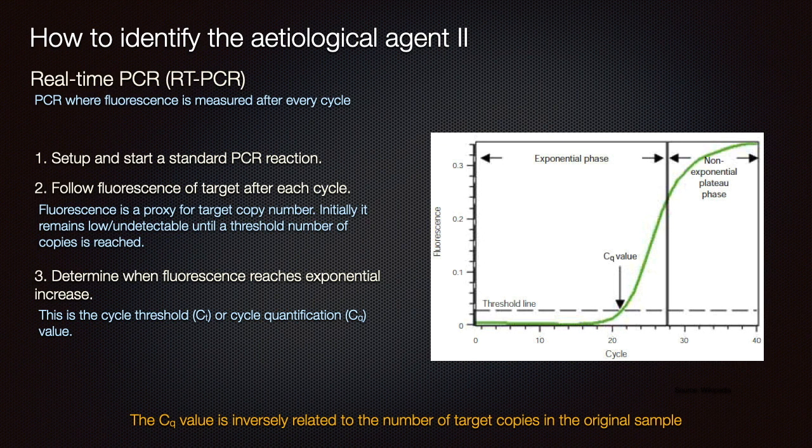Real-time PCR uses a special thermocycler. This thermocycler has a built-in computer and fluorescence detectors aimed at each reaction well in the machine. So as your PCR reaction progresses and product builds up, the machine detects fluorescence of your probe or dye after each PCR cycle.